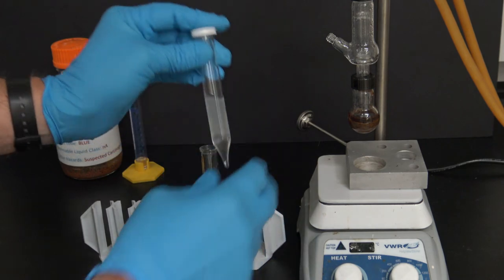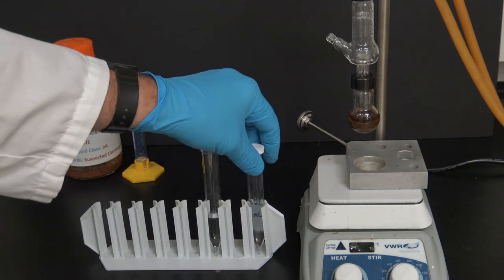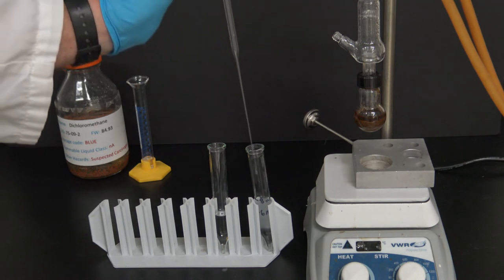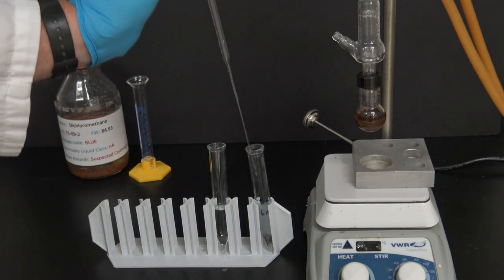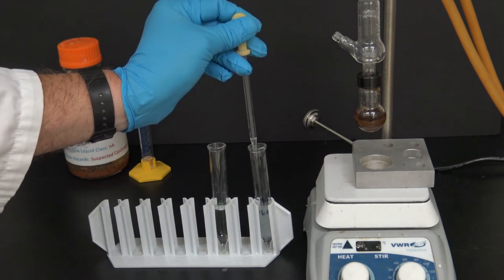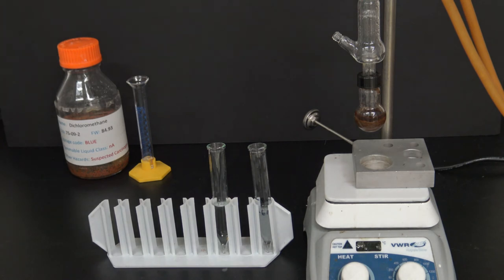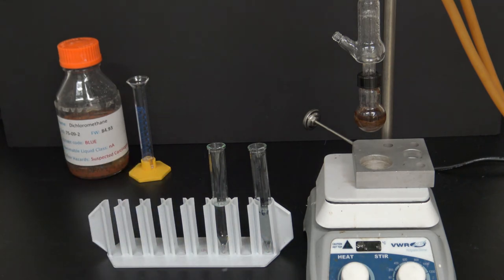Put the cap on. Mix it up well. And then let it set for a while so the two layers can separate. And now I'm going to remove the cap and transfer my methylene chloride over to my second test tube. So let's now review what's in these test tubes. This test tube is my aqueous layer, so it contains any soluble aqueous compounds. This layer here contains methylene chloride and our essential oils that we dissolved in the methylene chloride.